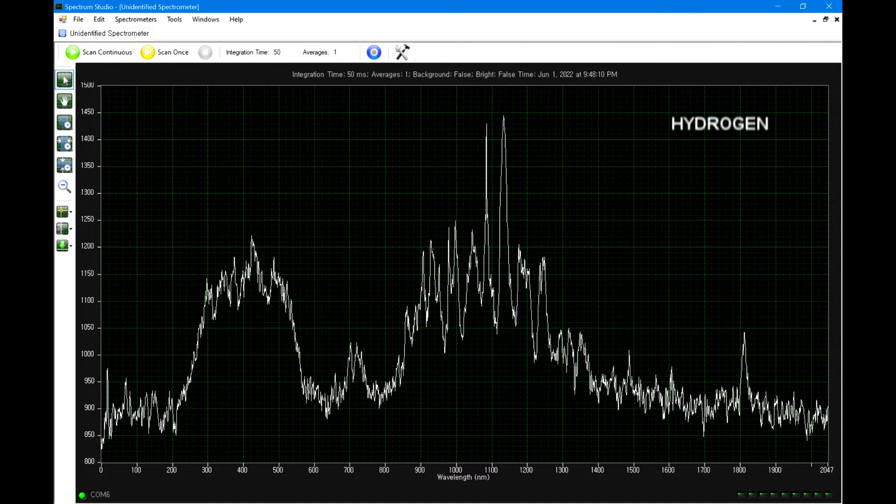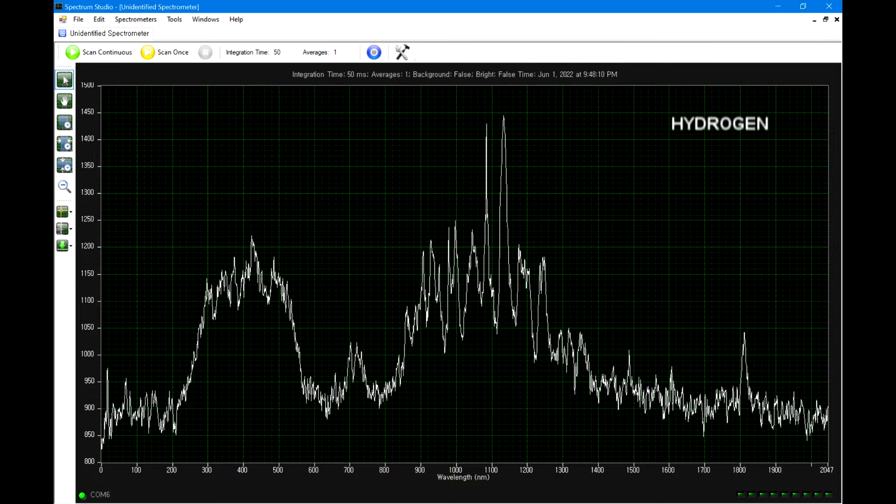In case you need this to calibrate your own spectrometer, here is my improved hydrogen emission spectrum data.